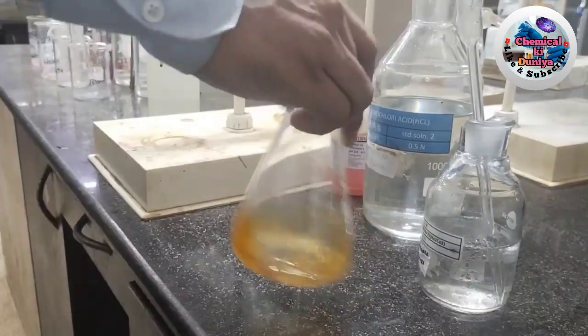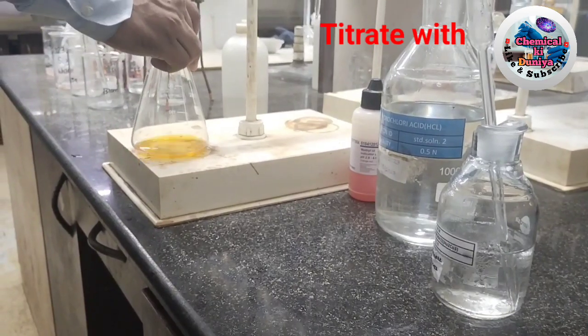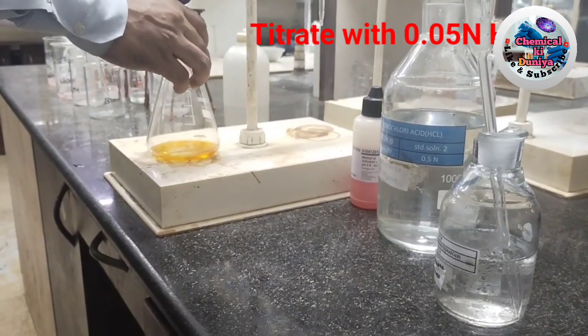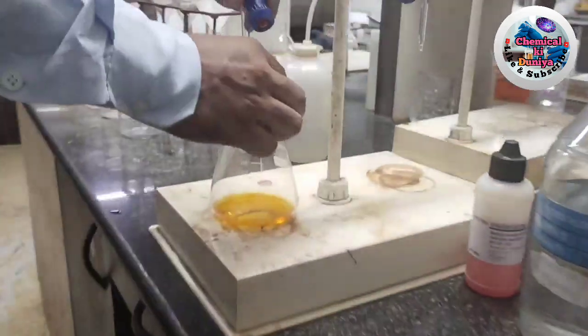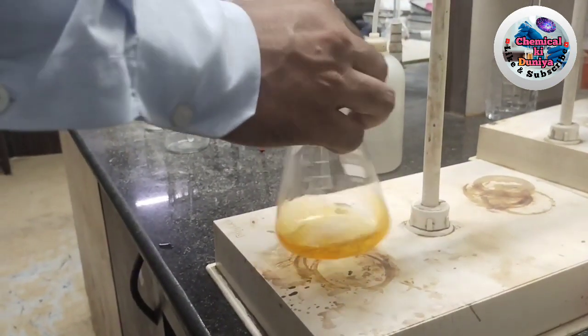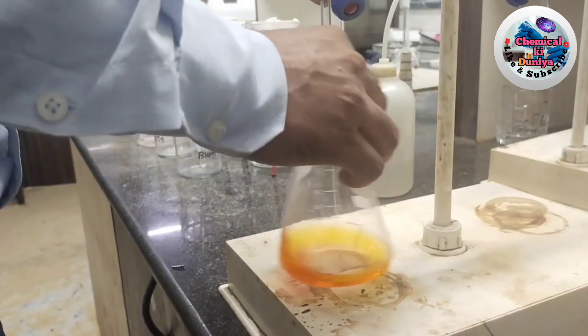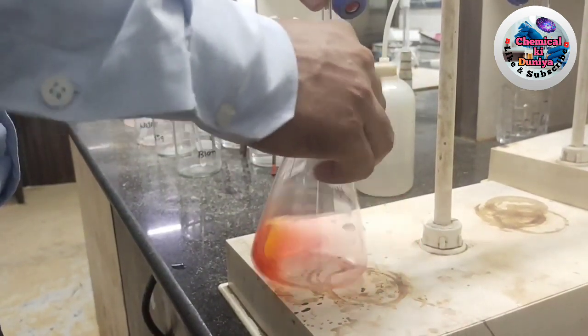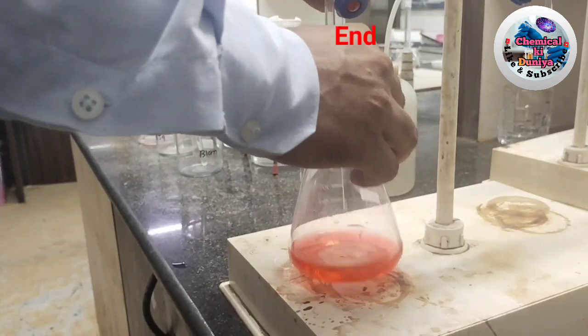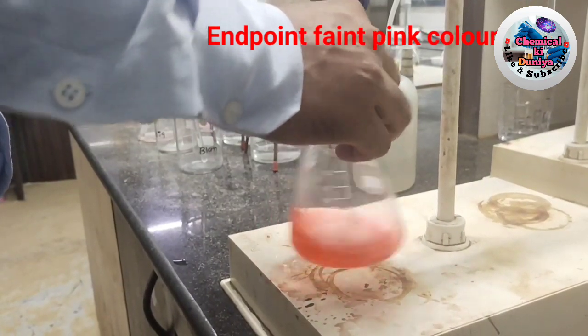and titrate with 0.5 normal hydrochloric acid. Titrate slowly, drop by drop. Friends, as you can see, the end point is a faint pink color. Note down the burette reading.